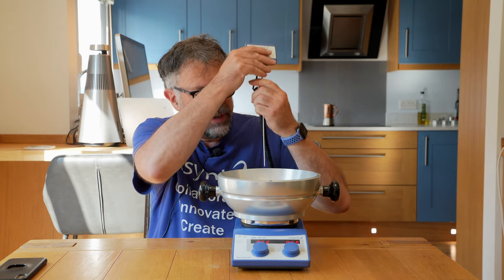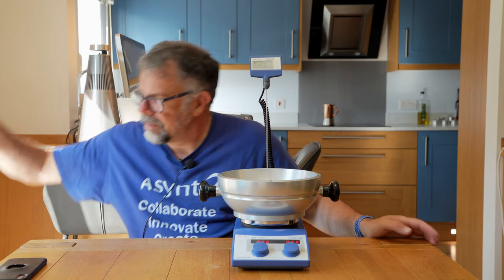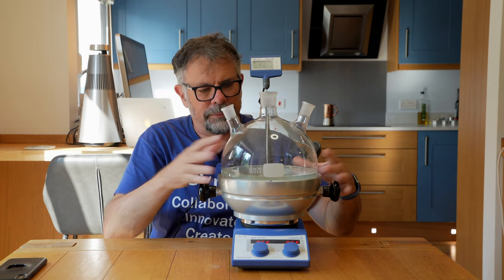We have the temperature probe socket in the rear, and then the five litre flask drops in like so.